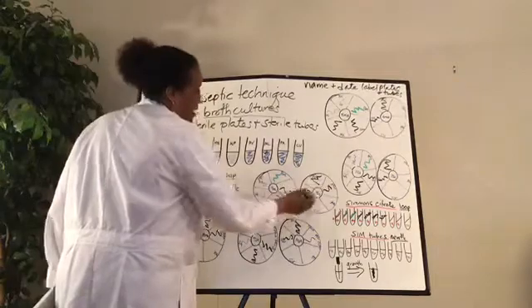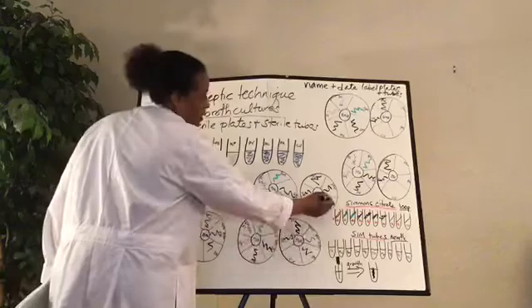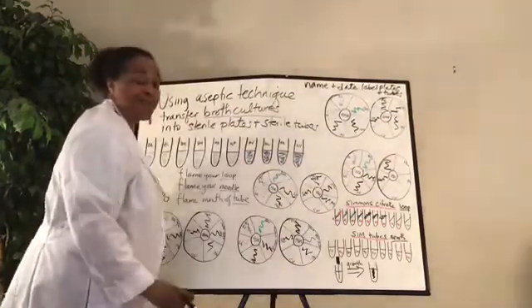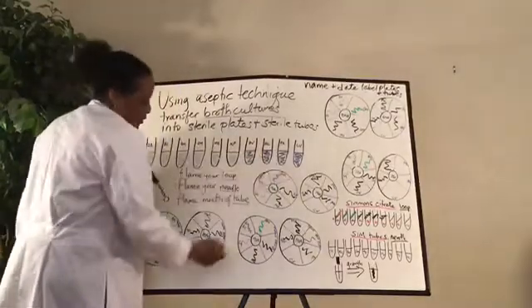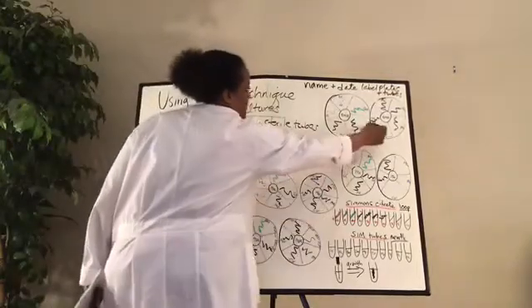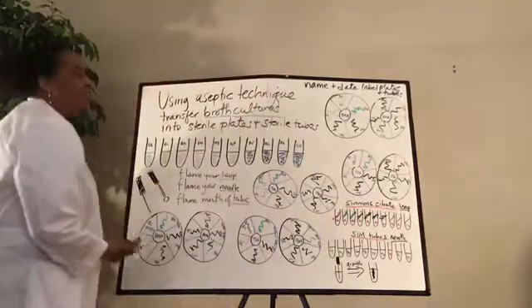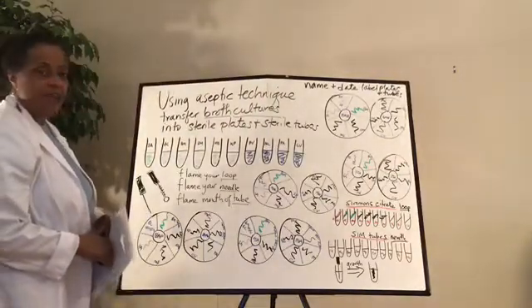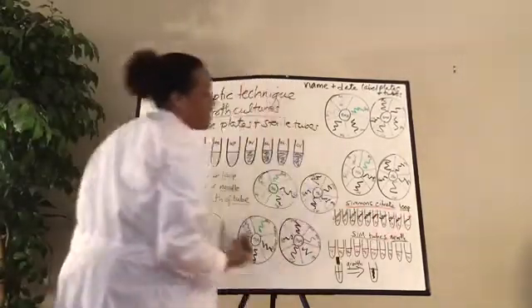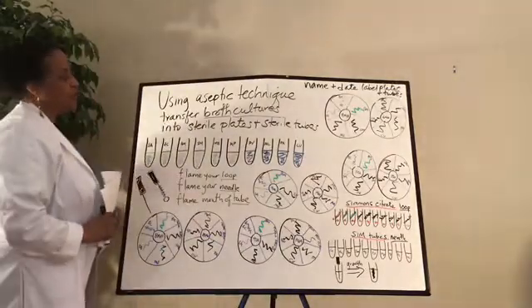Finish up here and here. Pseudomonas aeruginosa. Just do all of those. Oh, I forgot to do ML. Looks like I just did that with the Pseudomonas loop. Don't do that. And then Chromobacterium violaceum. And just finish up. And now, oops, I missed those. So now you have all 10 of your bacteria inoculated, that were once all the sterile broths and the sterile tubes, right?